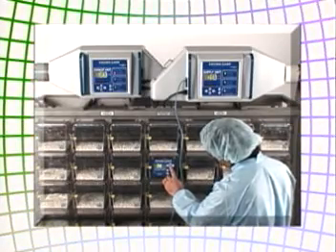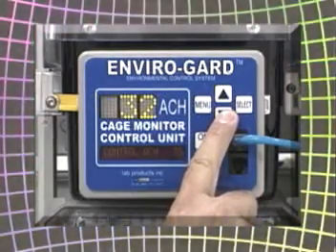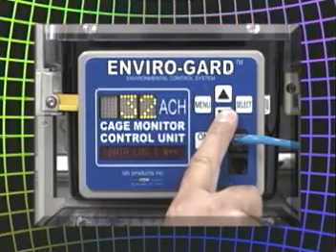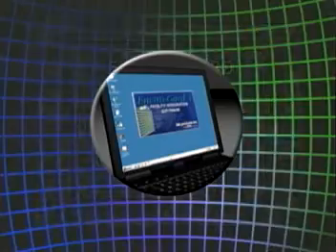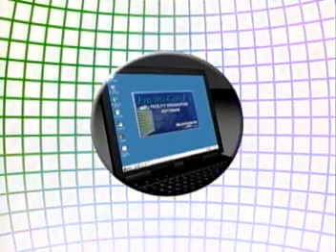Cage air changes per hour, temperature, humidity, and light level can be monitored around the clock. Data can be stored at several locations inside the control unit and downloaded later to any PC with an open serial port, across a local area network, or off-site by remote internet connection.